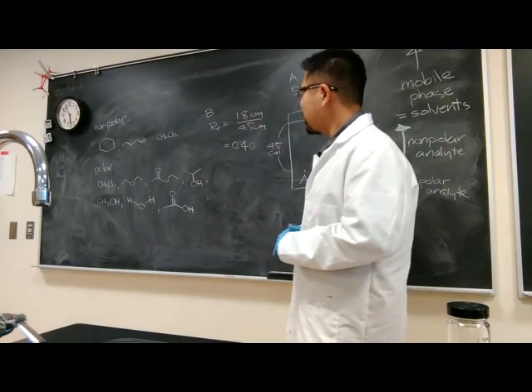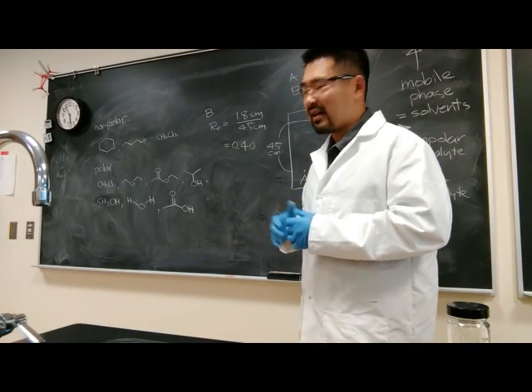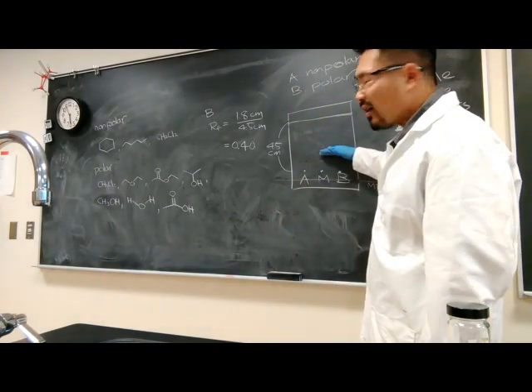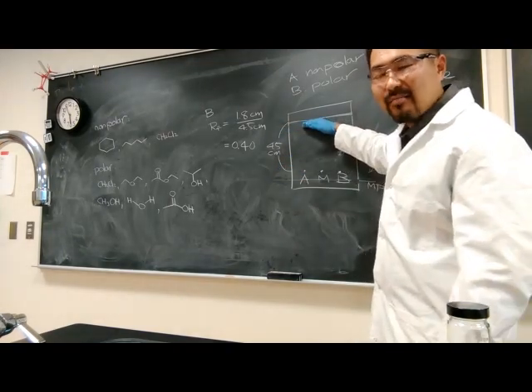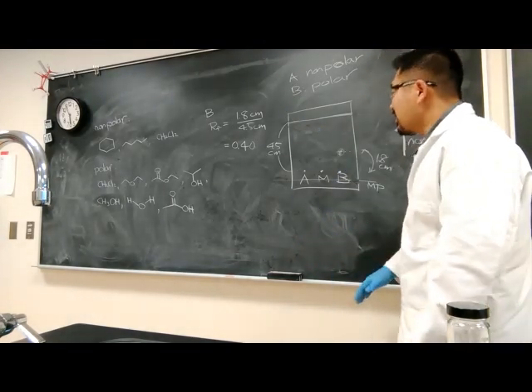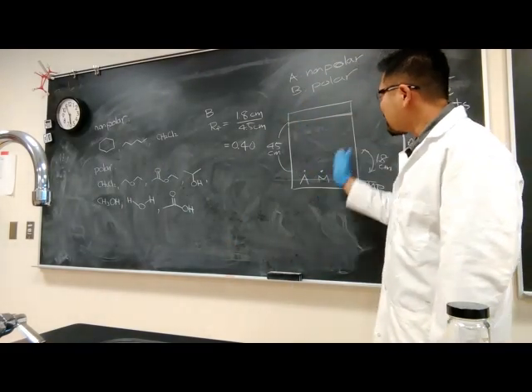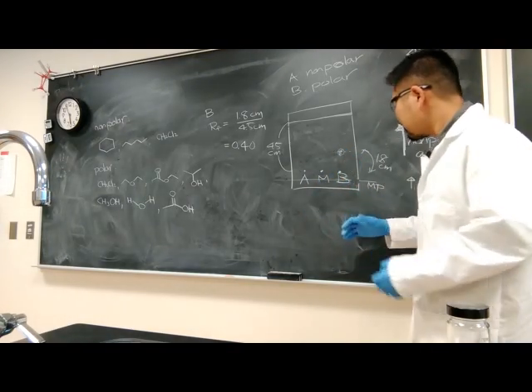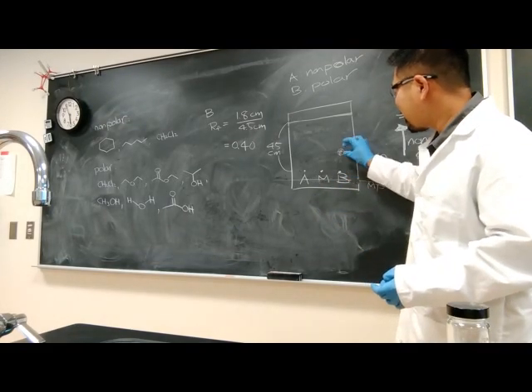examples. The reason why combination of mobile phases is convenient is because let's say that when you run your TLC plate, your RF values turned out to be just a little too high. That means your mobile phase is actually too polar, because if you think about it, if your mobile phase solvent is very polar, what happens is all the silica gel molecules on the TLC plate will be busy interacting with your mobile phase solvents, and they will not have time, so to speak, for interacting with your analyte.